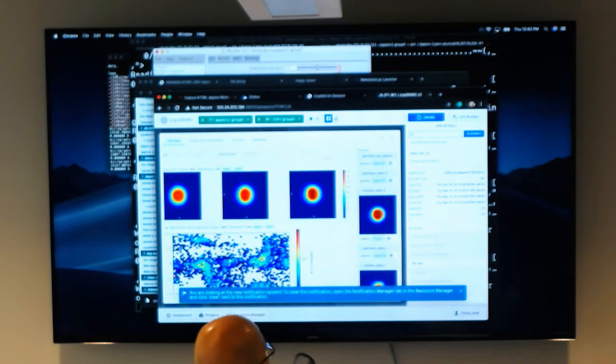And why is it so fast? You can see the count is pretty low. Very similar to Relion where you use fast subsets. It's not using your full data set. It's using a subset, and each iteration it adds more and more particles.